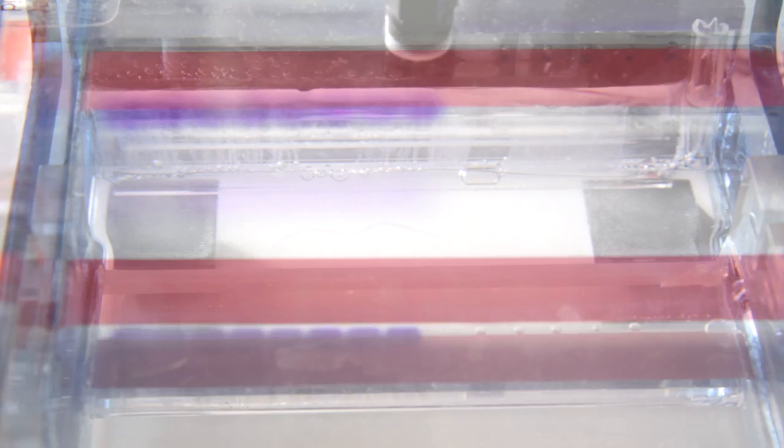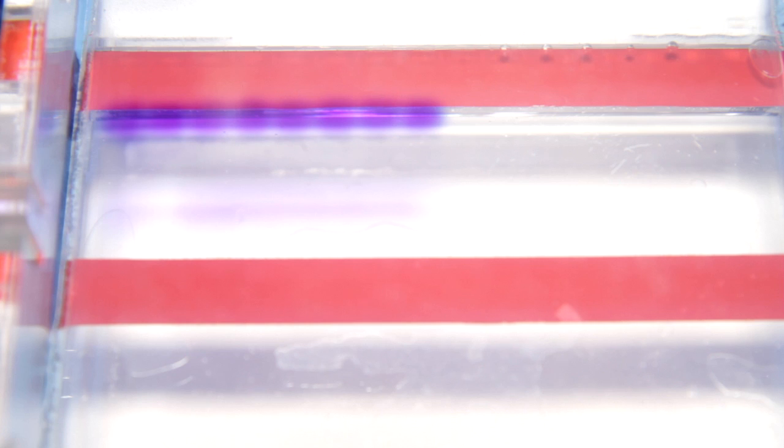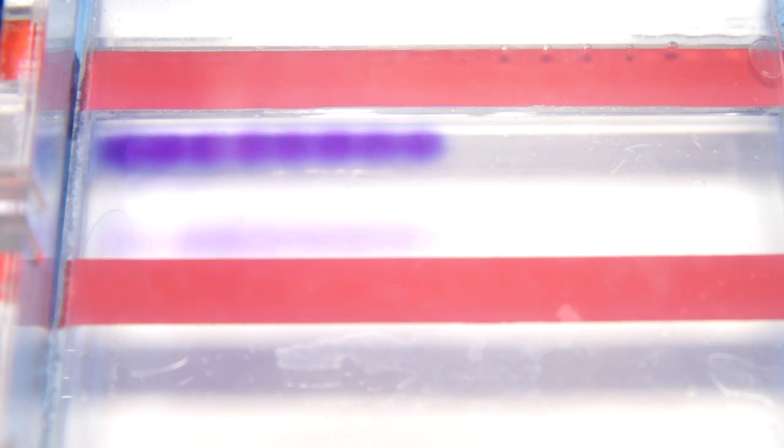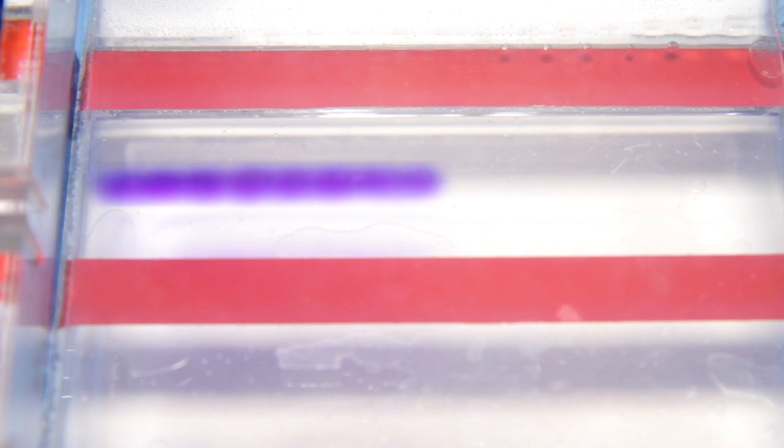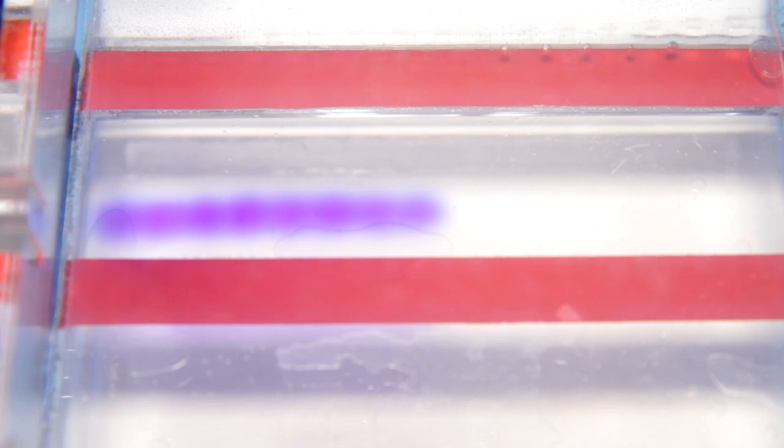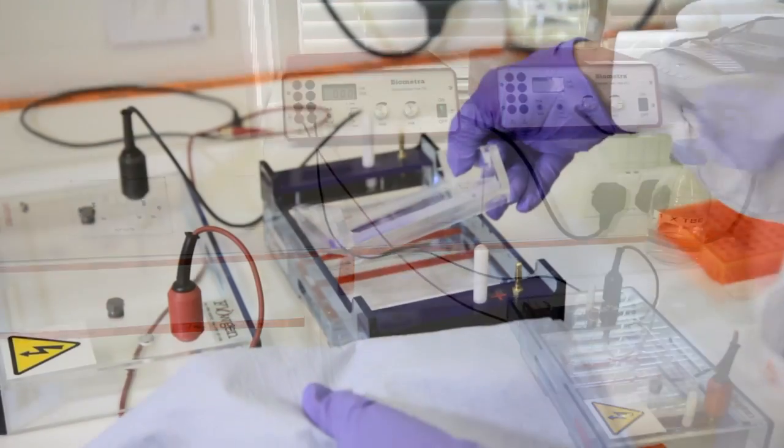You now need to let the gel run, and check it periodically. Gels often start running fairly slowly, but then speed up as the temperature warms up. The distance the DNA has migrated in the gel can be judged visually by monitoring the migration of the tracking dyes. When adequate migration has occurred, switch off the power and remove the gel tray.